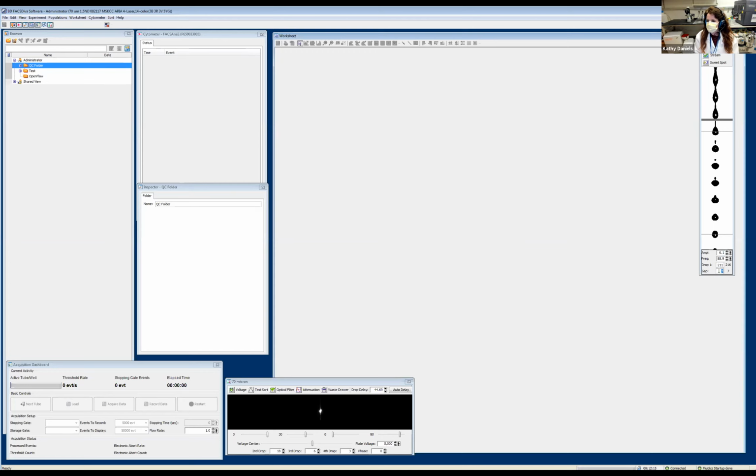What we typically recommend to our researchers who utilize the ARIAs for self-sorting training in the facility is to never change the frequency, because we typically have that set up in the core facility to a point that's optimized for the nozzles that you're working with. So what we say is to make minor modifications to the amplitude to get these values right here and right here for the drop one and gap to be as close as possible to our predefined values, right?